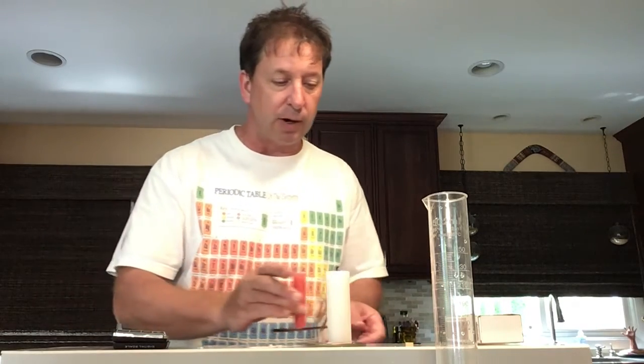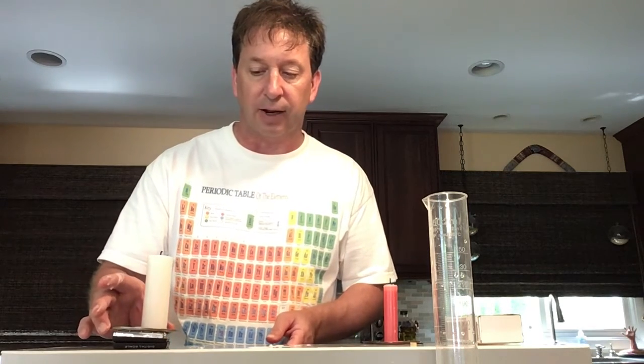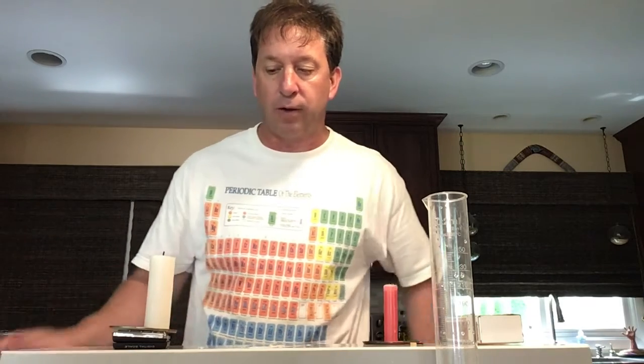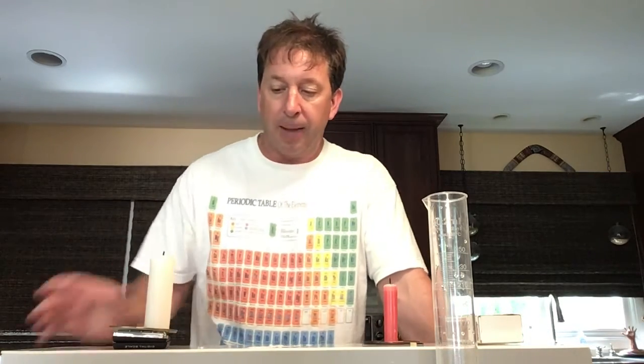And same thing for this one, okay? There's a little bit of a boo-boo there. I spilled a tiny bit, but that's almost insignificant, okay? So we're going to record the mass afterwards of the candle. Now again, you only have to do one of them. It doesn't really matter what color you have. But we're going to see what happens to the mass as you burn a candle, okay?